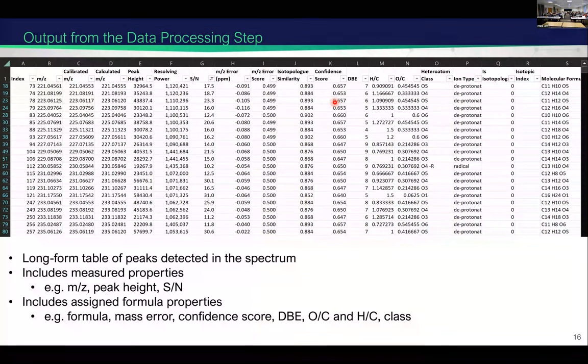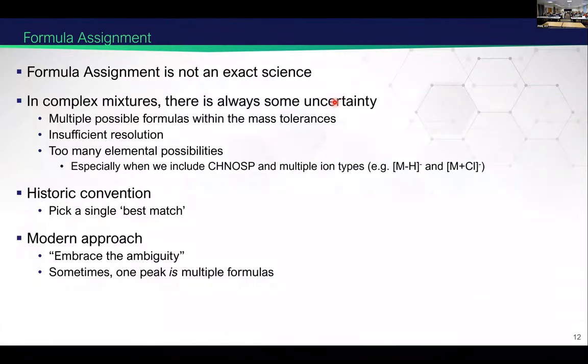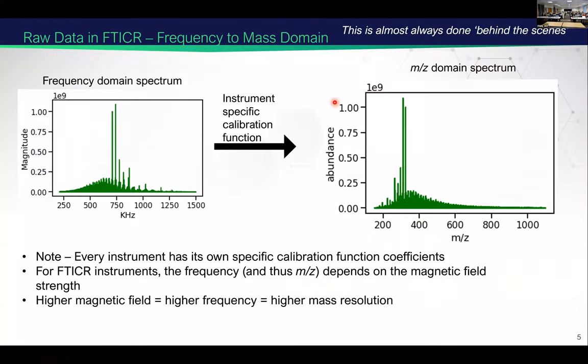From a scientific point of view, you're answering two different questions with those different techniques. I've got an example spectrum somewhere in here. The problem is that no chromatography, and people spent decades on this, is able to resolve the real complexity of organic matter, whether that be dissolved organic matter or soil or whatever. The best people have done is a sort of functional group-based separation, as in proteomics. They can separate out broad humps based on how many aromatic rings there are in their structures. But in environmental science and in organic matter, we're not there yet.